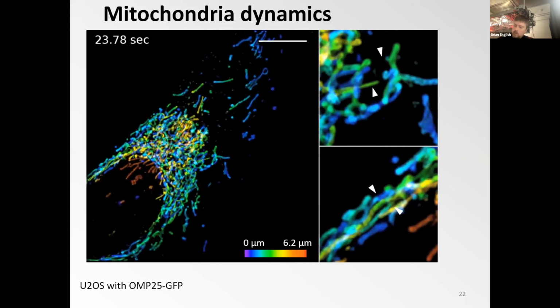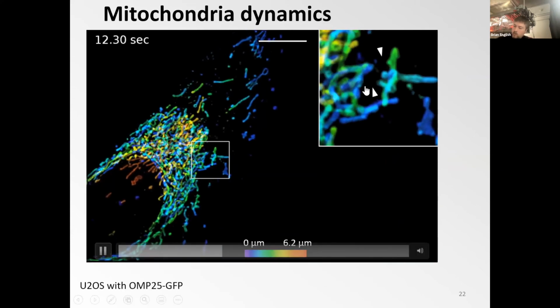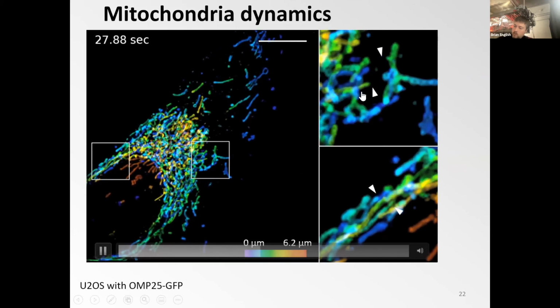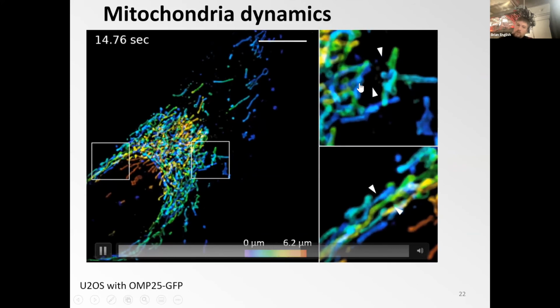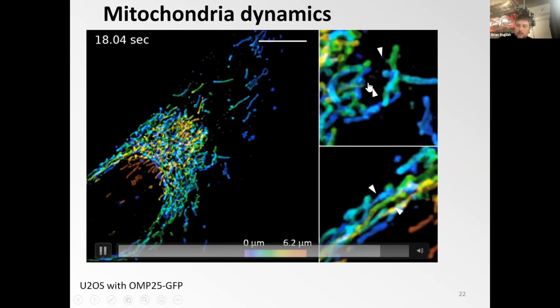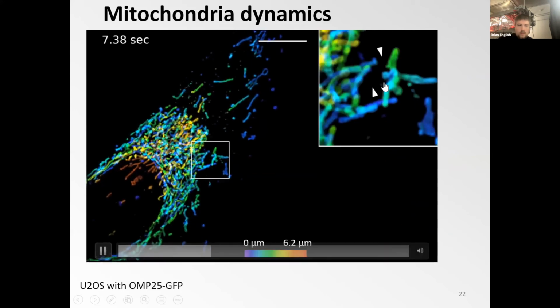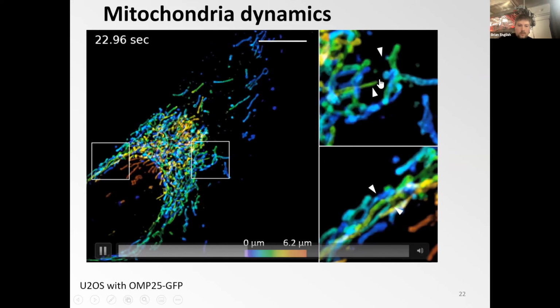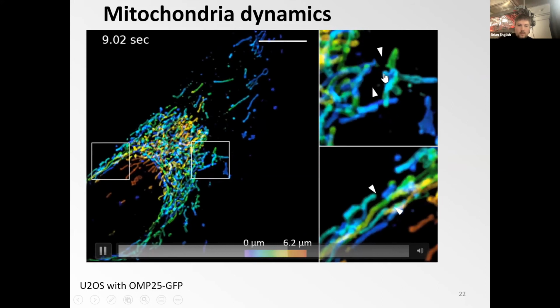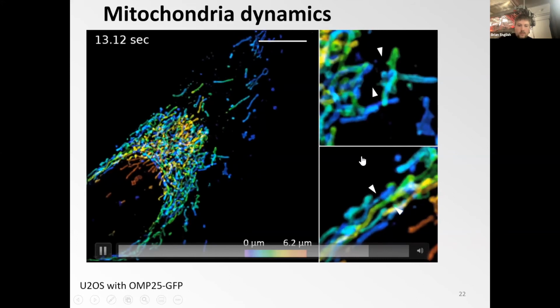And here you can see, I think they have been termed nanotubes, that shoot out of the mitochondria. If they're really nanoscopic can be debated, and if they're nanoscopic, we wouldn't see it because our resolution is still above 100 nanometer, but they still show some cool dynamics. What you can see is that the extension and retraction gets actually quite decently resolved in space and time.